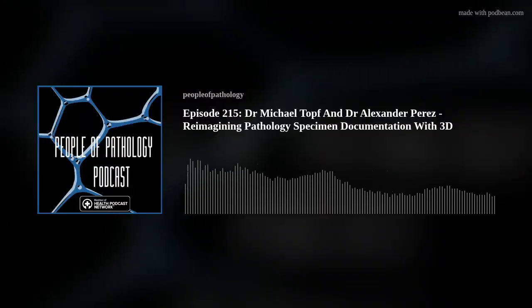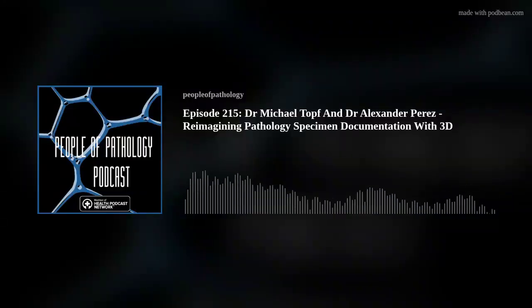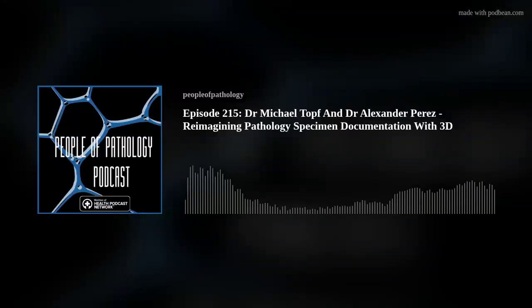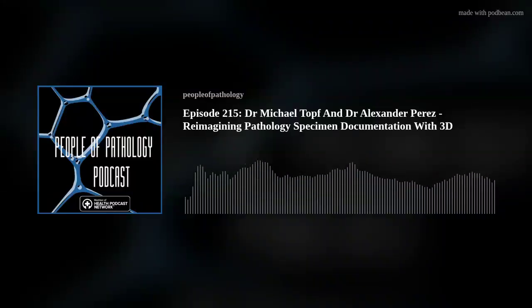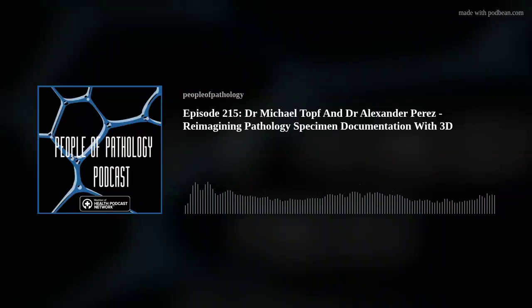Yeah, I can relate to that. Where I work, we get a lot of head and neck cancer specimens, and yeah, they're very complex. The margins are sometimes irregularly shaped, and the specimen isn't flat or even round. The geometry is weird, if that makes sense. It does, and it's composed of a lot of different types of tissue.